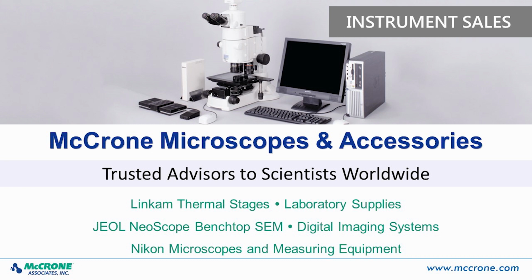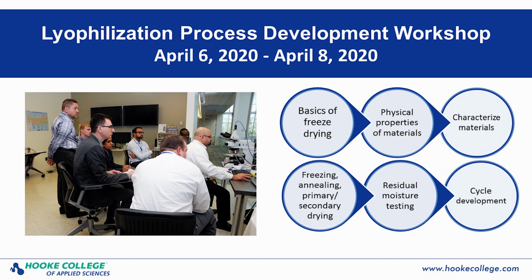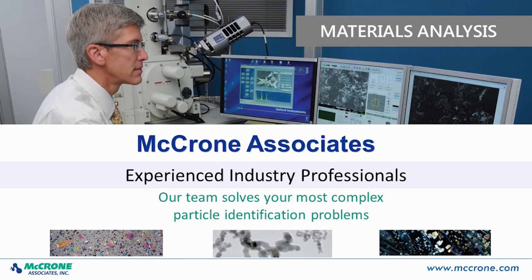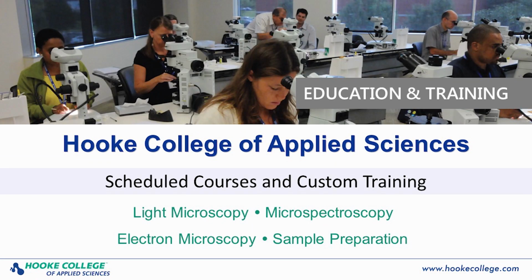And then on the other side, a lot of people aren't looking at investing in controlled nucleation on the production side if they haven't developed cycles with controlled nucleation on the R&D side. So it is a little bit of a chicken and egg there. I would definitely recommend looking into controlled nucleation, and whether that could be feasible and beneficial for your product and your process. But there are things you can do without it that may improve, to different degrees, the ice structure within your product and help optimize the freezing side of that freeze drying cycle.